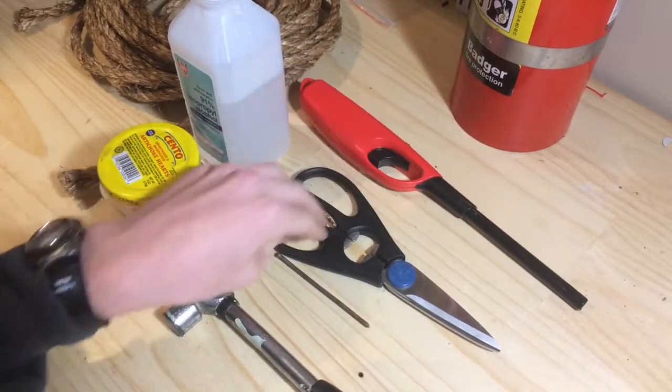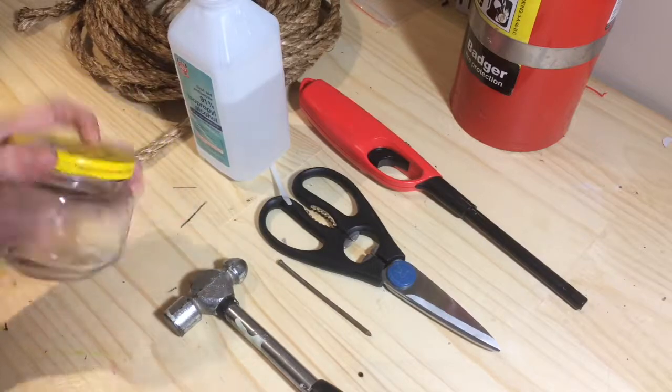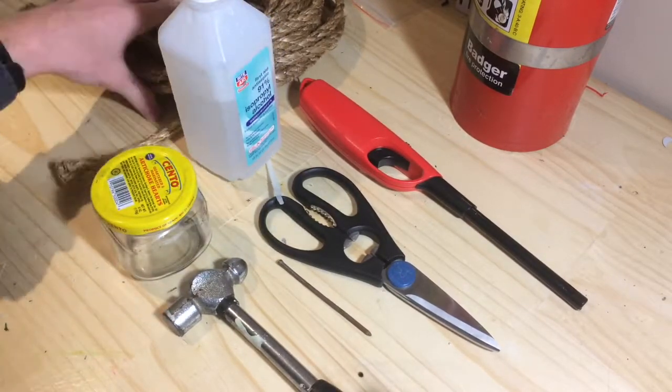So what you're going to need is a lighter, scissors, a nail, a hammer, a jar to hold your rubbing alcohol, rubbing alcohol, and rope.